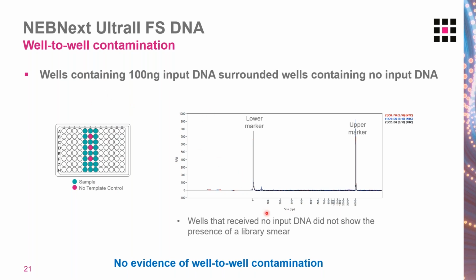And then I'm showing you here the fragment analyzer trace for just these no template controls, so just the samples where we didn't put any input DNA in. And we're seeing no library peak, which is good. So this does show that we don't currently have any evidence of any well contamination. Yes, this is a limited data set. We're still building this data up, though these initial results are encouraging.